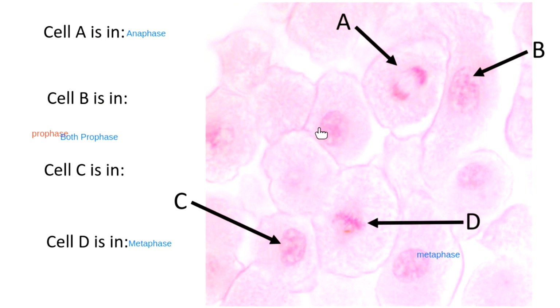In terms of cells that are in interphase, which is not part of mitosis, right? But cells that are in interphase, we said that their genetic information isn't really clumped up at all. We can't see it very well. Some of these cells, when you look at them, you don't even really see the nucleus in them. Some of these cells would be interphase cells because I can't really see their genetic information. It's really stringy and it's just hard to see. So some of these would be our interphase cells that aren't even doing mitosis. Once I start clumping up that genetic information, you start to see it, and that's when I'm in prophase. And we got metaphase here, we got anaphase here. I don't really have a telophase on this slide.